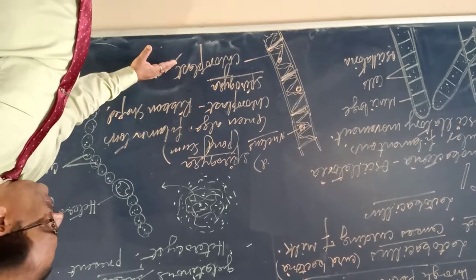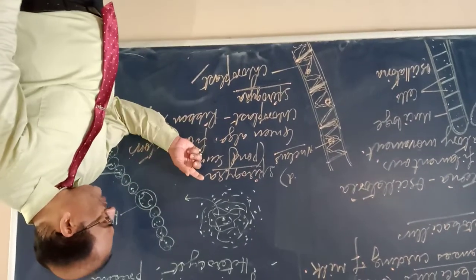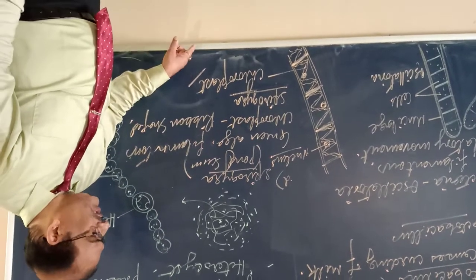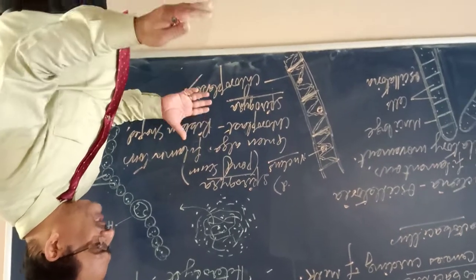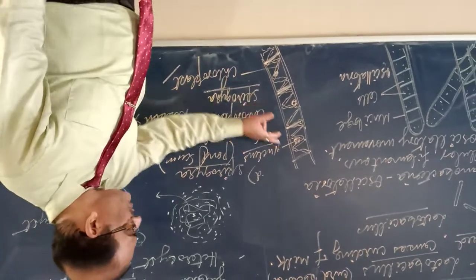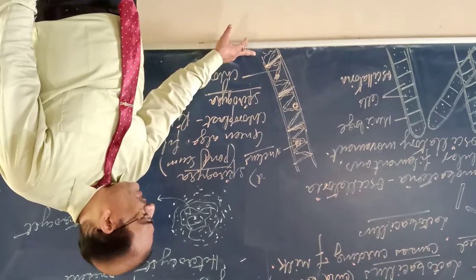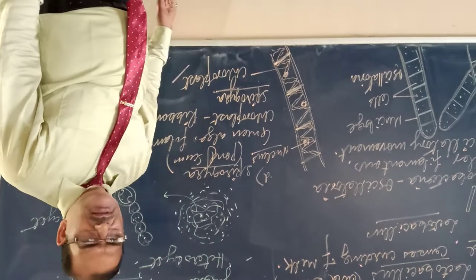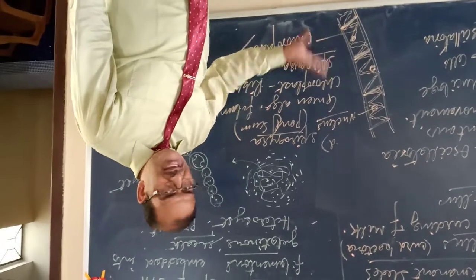Spirogyra. Reproduction, vegetative भी हो सकता है by fragmentation, and sexual reproduction it shows by conjugation. It reproduces sexually by conjugation and asexually, vegetatively, by fragmentation. The filaments can fragment and can give rise to new Spirogyra. Simple. The filament is attached to the surface or any structure with the help of holdfast, and it is what? Silky. Its filaments are long and lush green, shining green and silky, found in fresh water, running water.